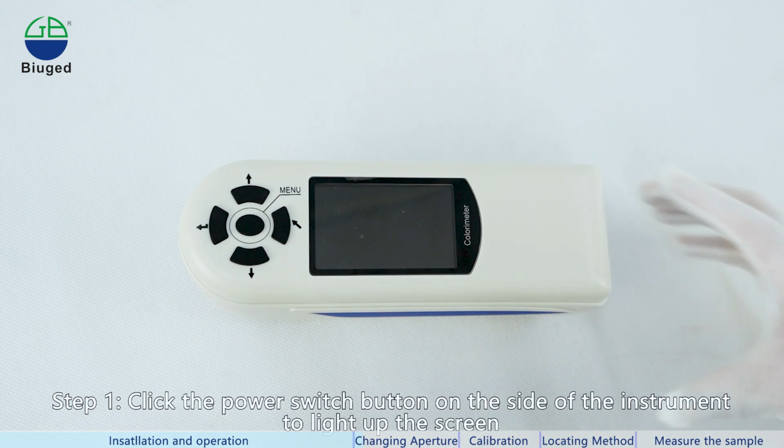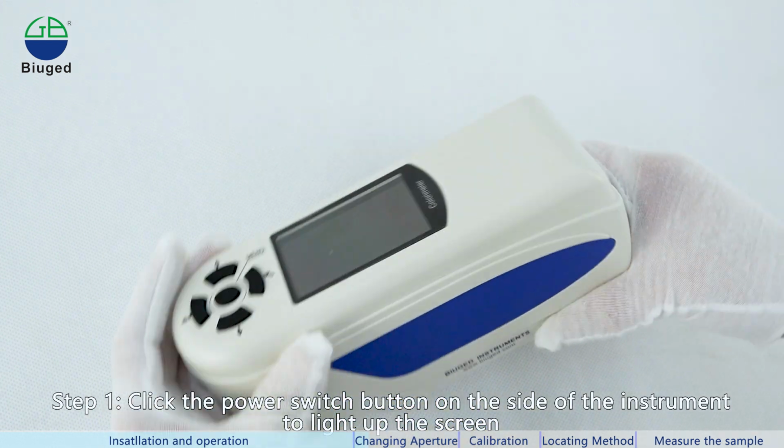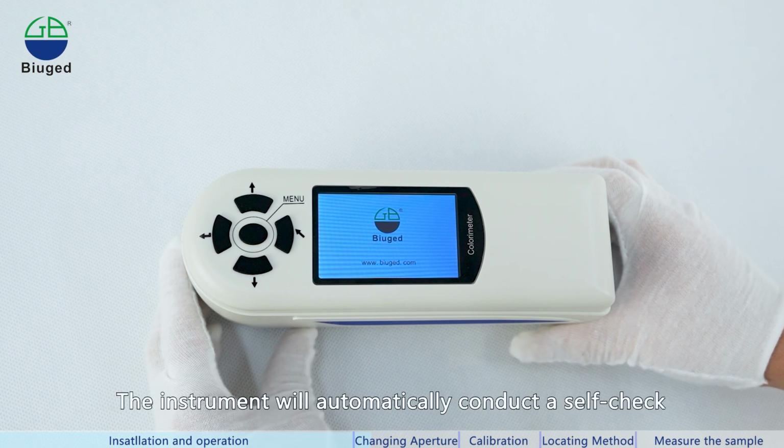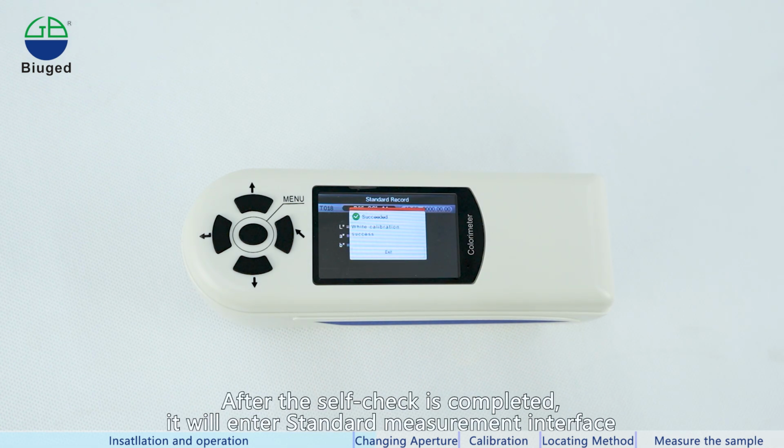Step 1. Click the power switch button on the side of the instrument to light up the screen. The instrument will automatically conduct a self-check. After the self-check is completed, it will enter the standard measurement interface.